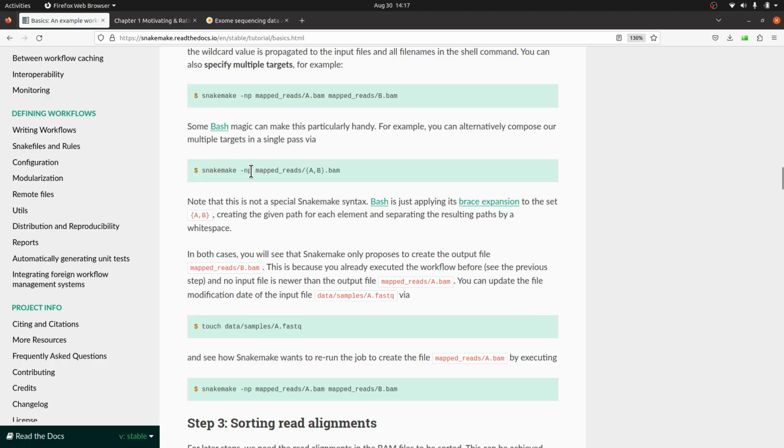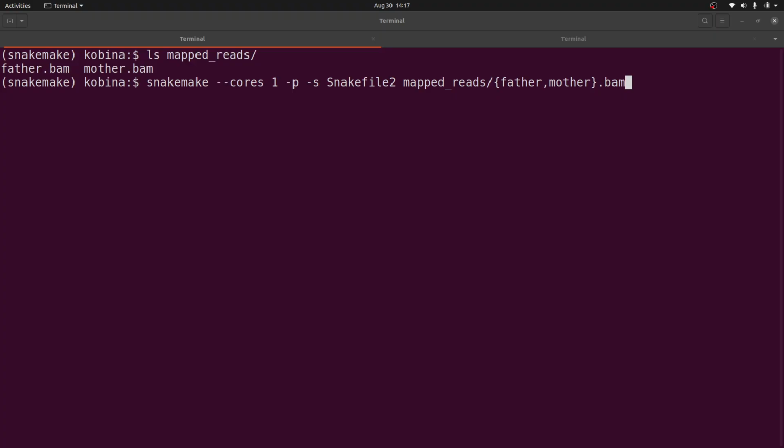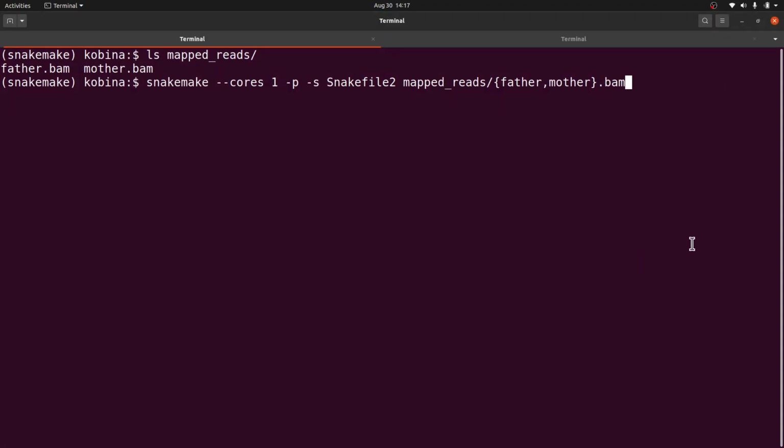That is what has been indicated here as well. You can try this, and you can see that one also works. Anyway, let's try that quickly. We will try it like this to specify multiple samples. You can also add the proband like this, and that will also work. But with this approach, let's just leave it like this. Let's execute this command and see what happens.